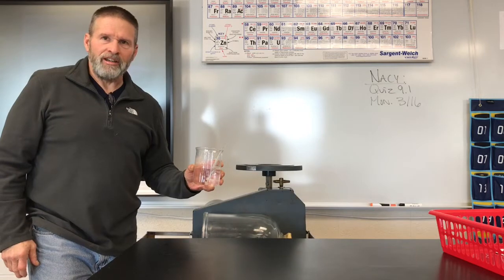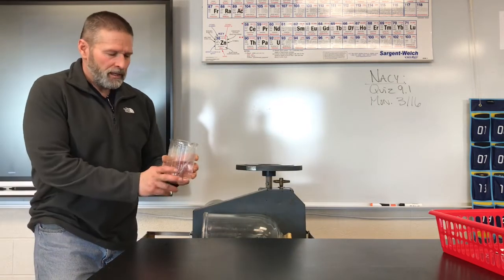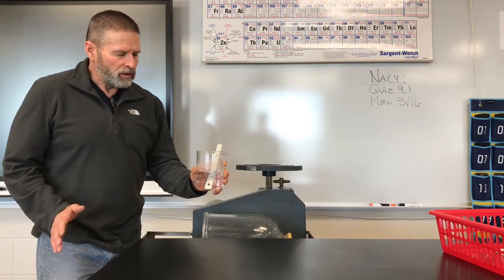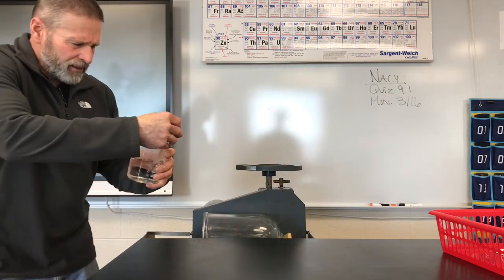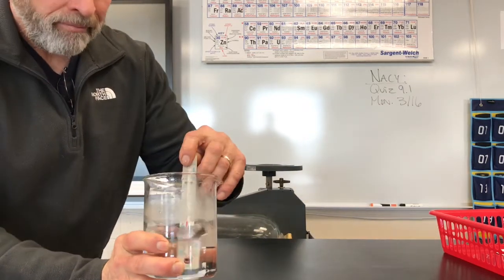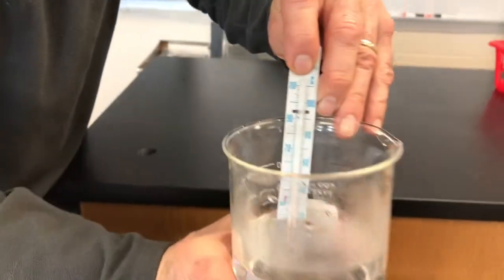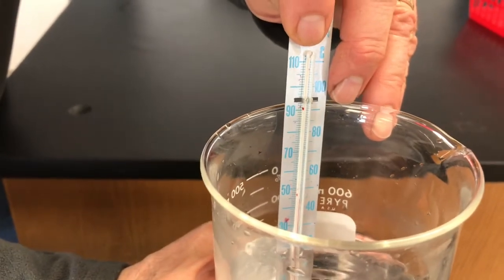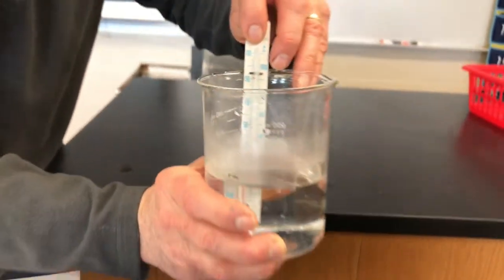All right, Chem Nation, here is another vacuum pump demo. So what we have is a beaker of lukewarm water. I have a thermometer in here that's reading about 45 degrees. In case you don't believe me. Water is definitely not boiling.